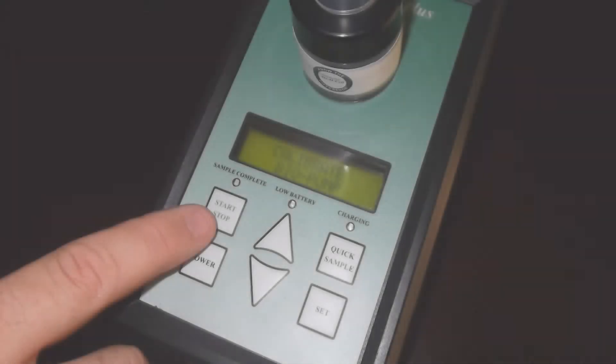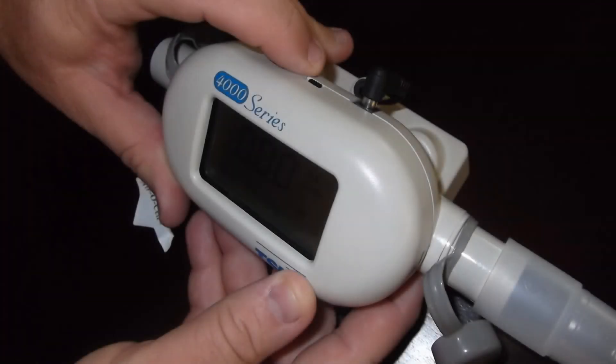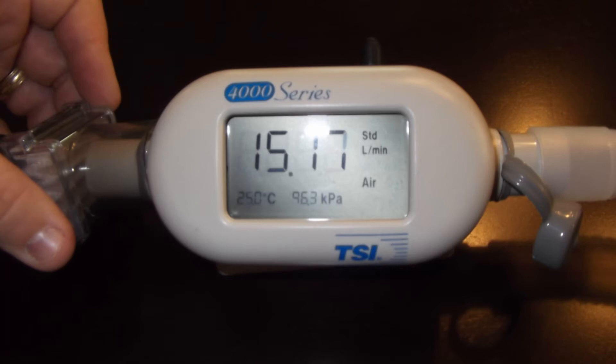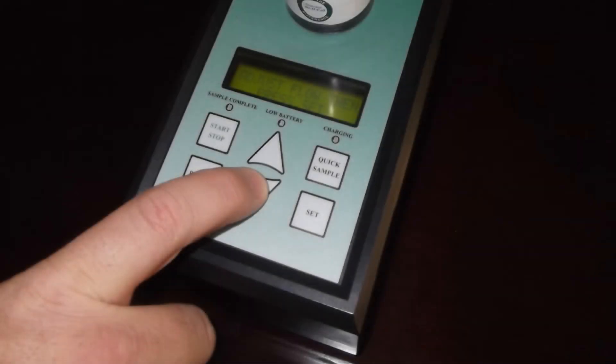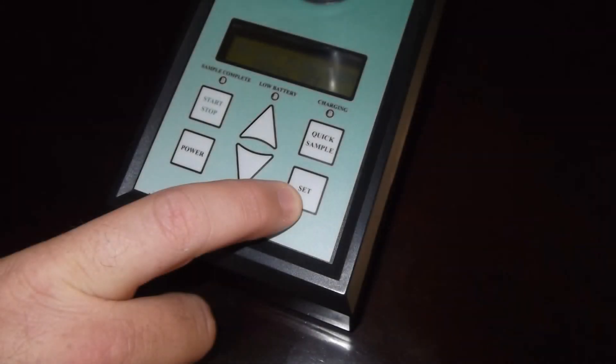Turn on the pump and go to the calibrate bio-pump screen. Then turn on the TSI calibrator and adjust the flow of the bio-pump to 15 liters per minute on the TSI calibrator using the up and down arrows on the bio-pump. Once flow is achieved according to the calibrator, press set on the pump.